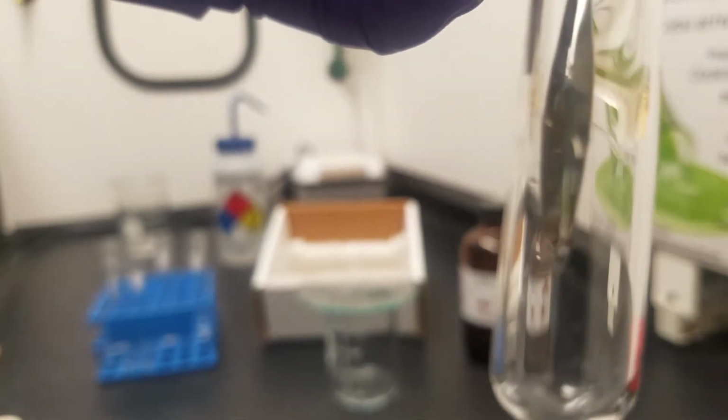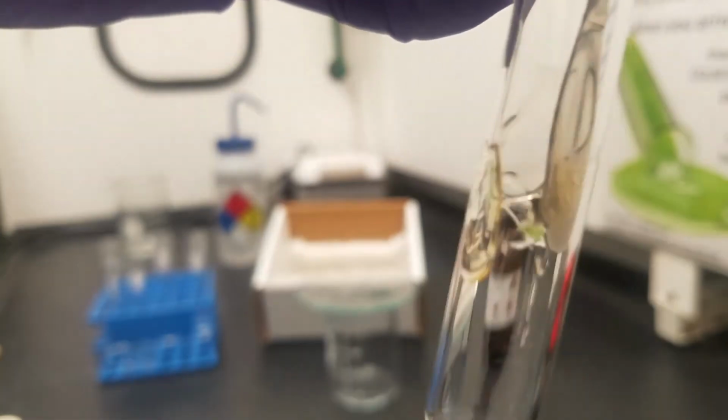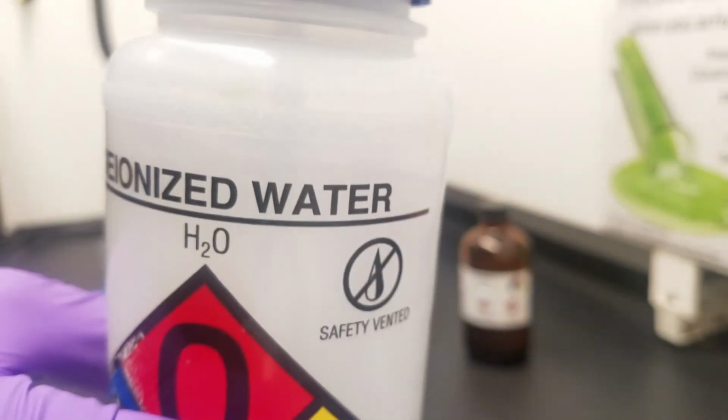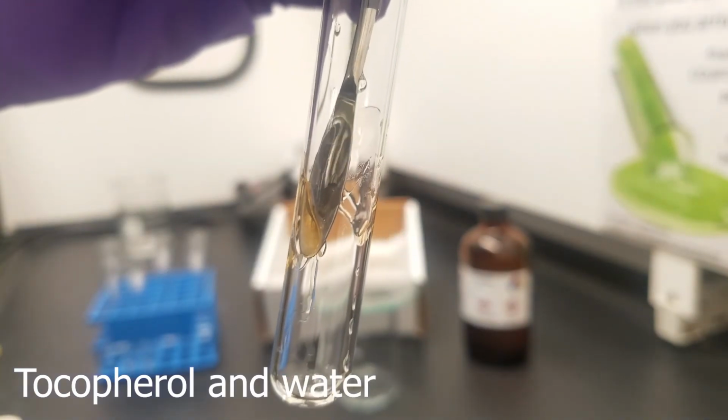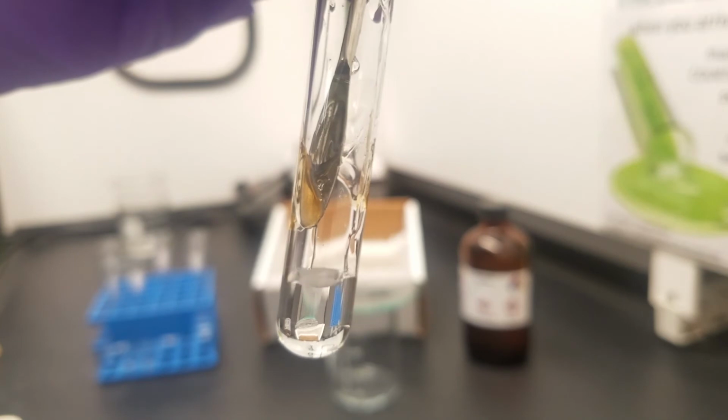And now the fun one, tocopherol. Tocopherol is a kind of honey viscous mixture, which means we can't really measure out 30 milligrams well. So what I'm struggling with off camera is dipping a spatula into the tocopherol and picking up some of that honey mixture and now putting that in the test tube. Okay? Now we'll add in our water so that we can observe and try and get that to dissolve.